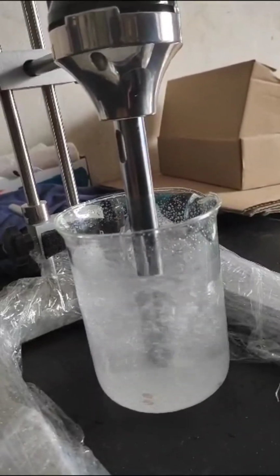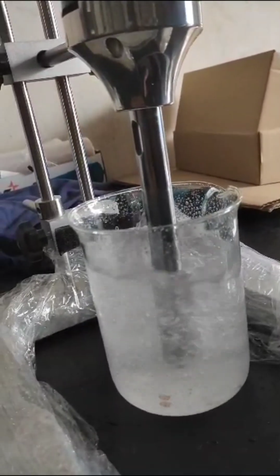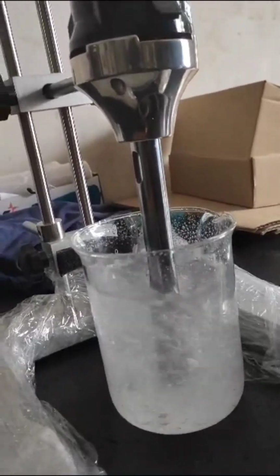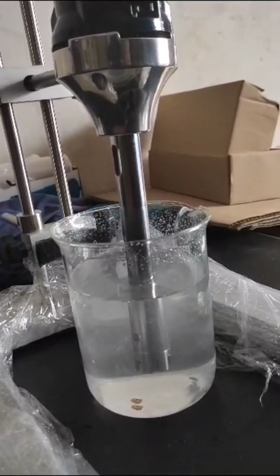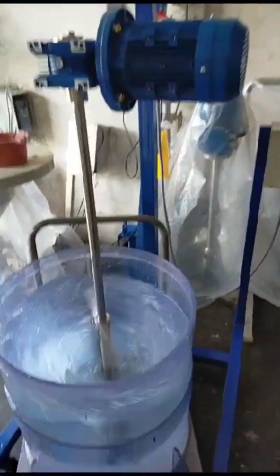5. Consider the material of construction. Select materials that are durable, corrosion resistant, and suitable for the specific application. For example, stainless steel is commonly used for homogenizer stators and rotors due to its resistance to chemical reactions and wear. 6. Prototype and testing.